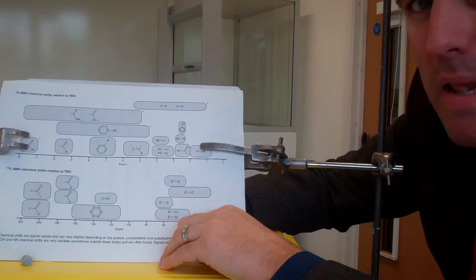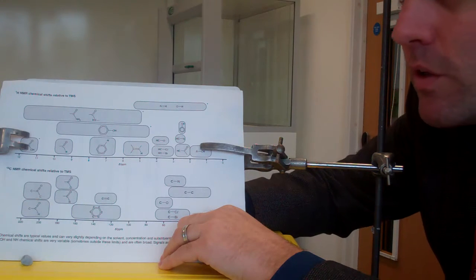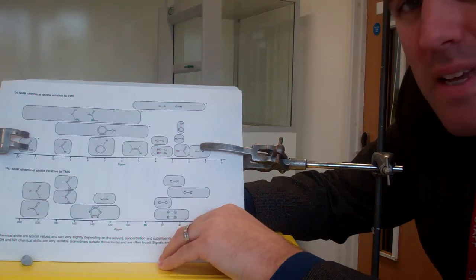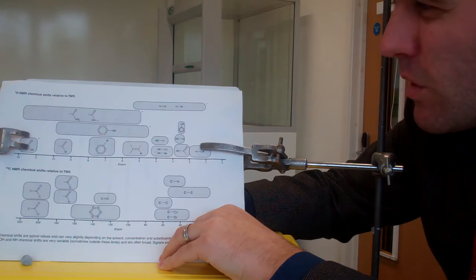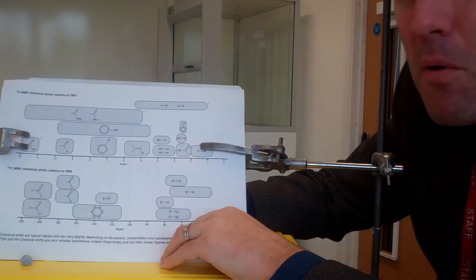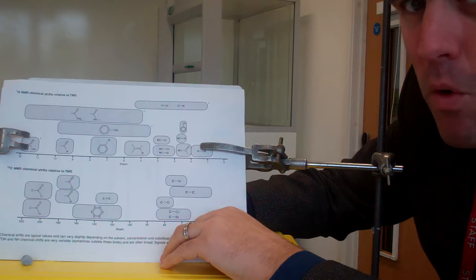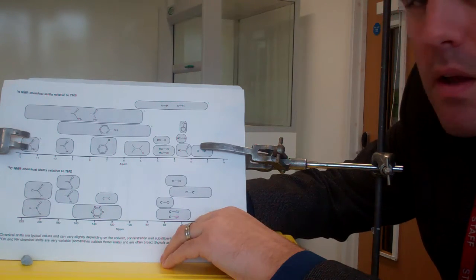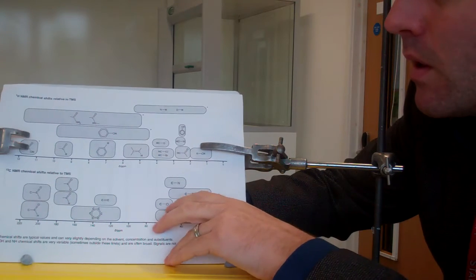So the parts per million isn't something we can use to definitely say this is this. It doesn't work quite like that, but it gives you an indicator, gives you an idea. So quite often you need to know more about a molecule rather than just the NMR. It'll be hard to identify a molecule simply from NMR. You need more information, and that's why it's quite often combined with other techniques like mass spec and IR.